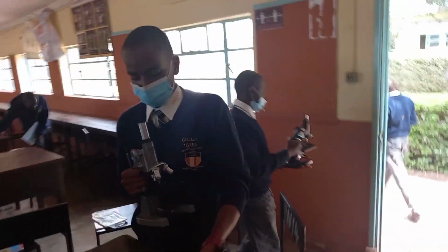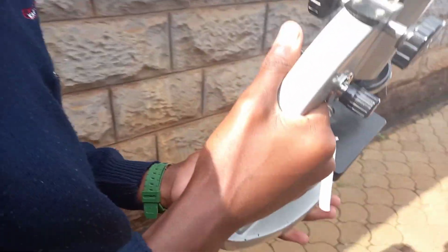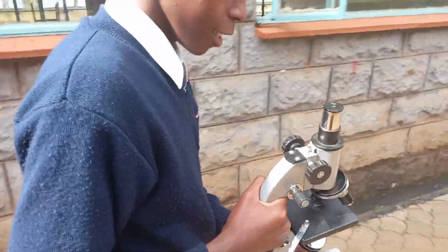We take the microscopes back to Biolab 1. And how do you carry the microscope? You hold the arm and the base to support the microscope.